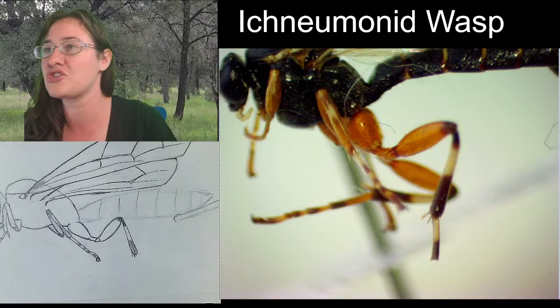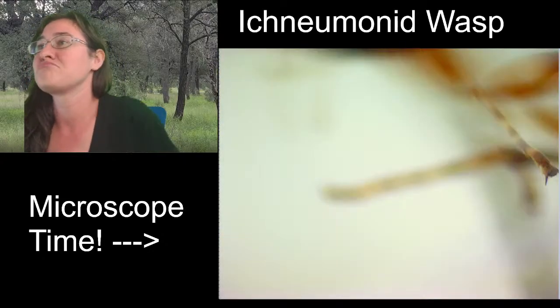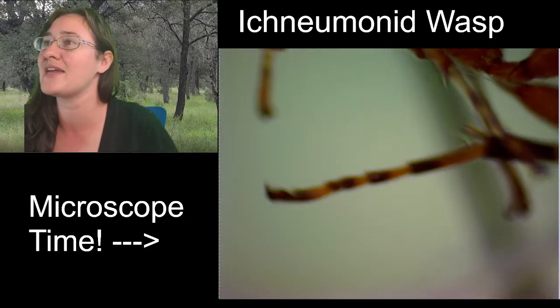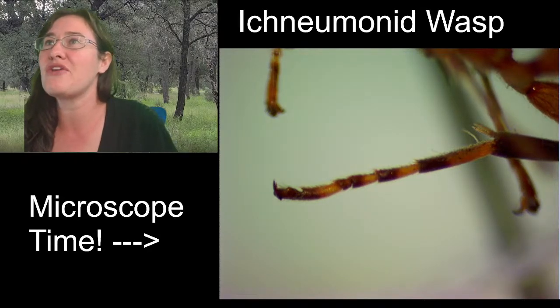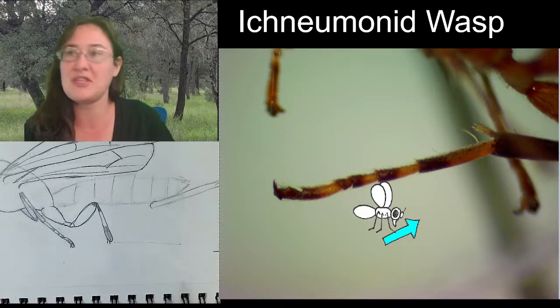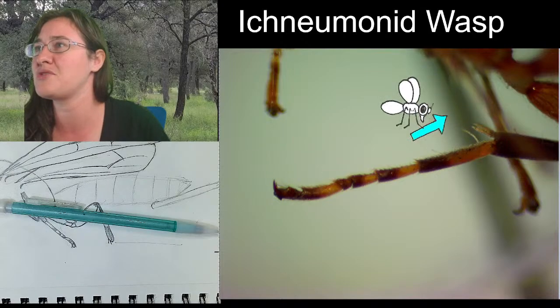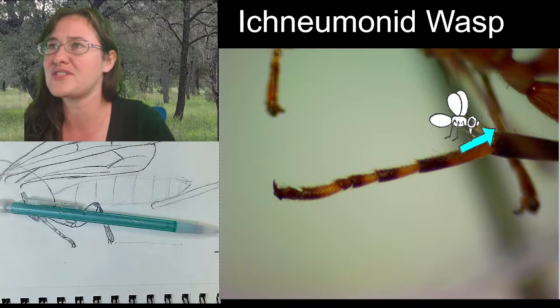Then I'm going to focus through the insect so that we can see the tarsal segments on the far leg, because the ones that are close are unfortunately broken. Keep in mind that the way the wasp is holding its leg, these tarsal segments are upside down. If you were going to sketch it like I'm going to be sketching, where I'm putting the tarsal segments out in this direction, you're going to want to flip these upside down, because this is the bottom of the foot. You can see the tibial spurs here. So it's kind of sitting like this, with its feet up.